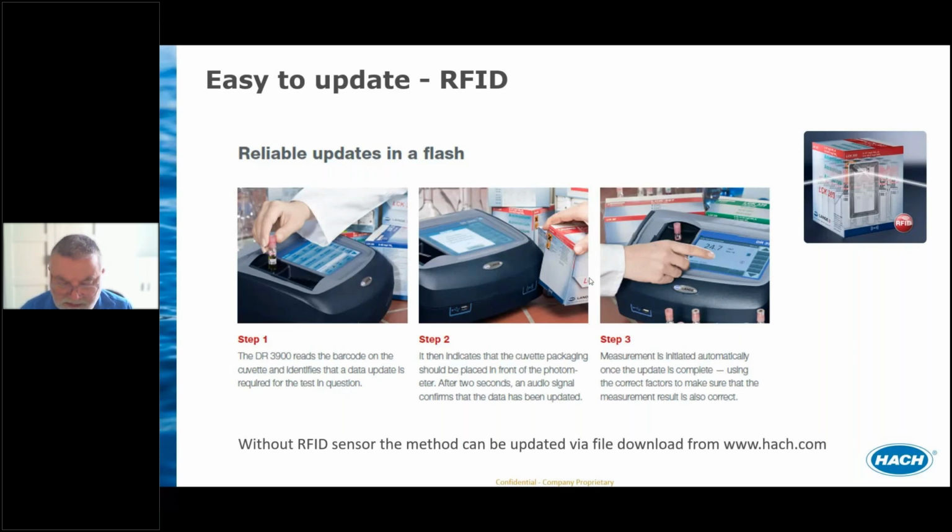And at this time, the operator simply holds the box up to the RFID reader, and all new parameters will be updated into the meter.